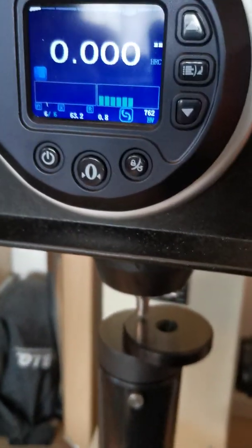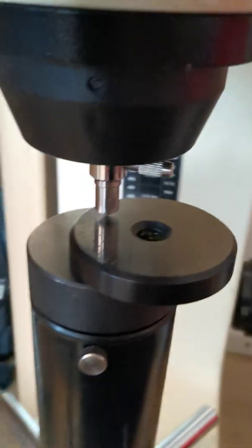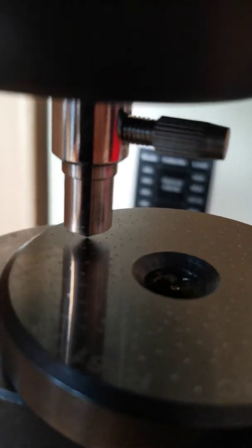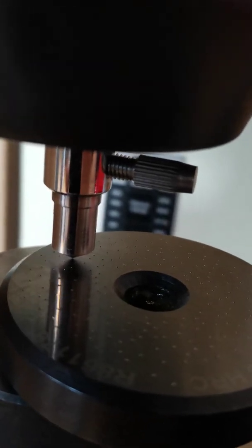That's basically how Rockwell C testing works. It's very important that you have enough steel and always the same amount of steel to push away. You can see here I've picked a spot which is at least two millimeters away from all other dimples.